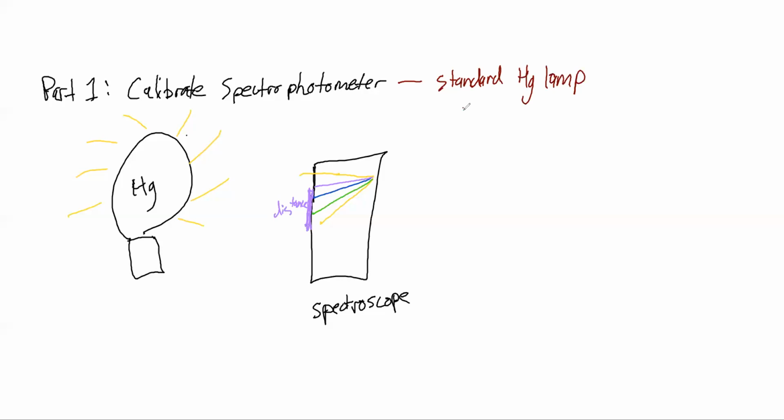And we're going to record the distance in centimeters. And then we're going to eventually use those standards to create a calibration graph.